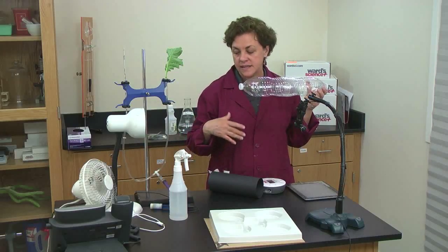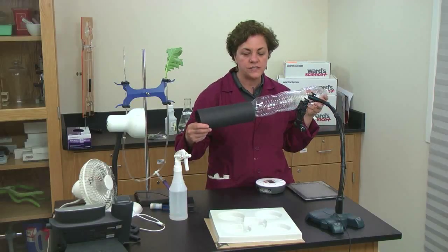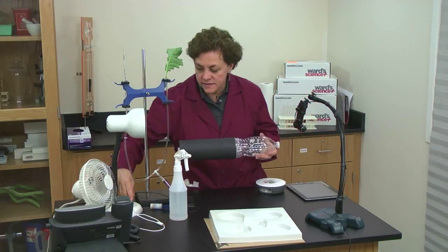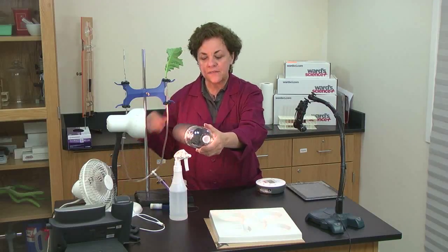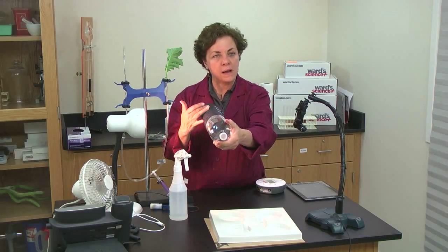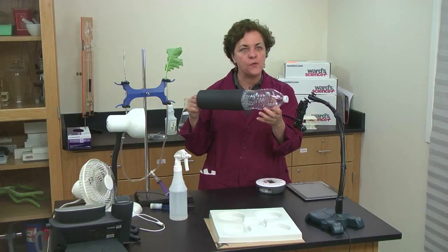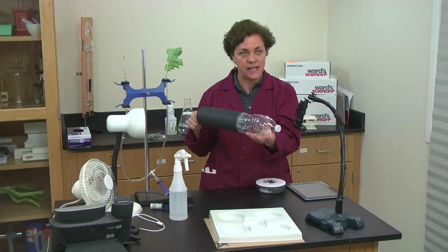quantitative as far as experimental conditions, you could take some black paper, put it on one, take this light, turn it on so that it's on both parts of this, and then after a while, obviously the dark one is probably going to warm up a little bit more than the clear, and you can then measure inside the chamber before you add the flies. If you try to measure after you've added the flies, you're going to be catching the flies.